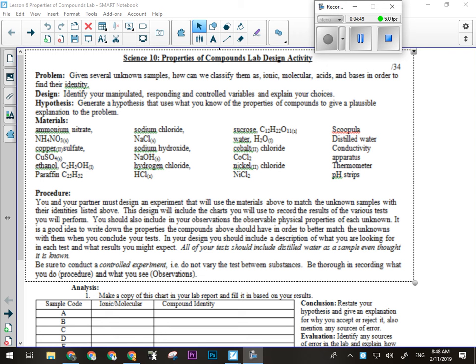And like I said, it has a scale of 1 to 10 in terms of the conductivity, and all you do is press the button. The on light will come on, which makes these ones vastly superior to the ones we had before, which didn't have an on light. So if the battery was dead, you put it in, it read everything as 0, and you just assumed nothing conducted because you didn't know any different. These work better. So when you put them in something that does conduct electricity, then of course the rating will go up.